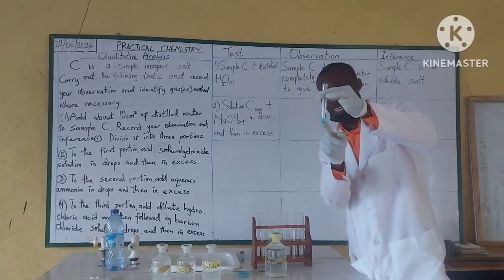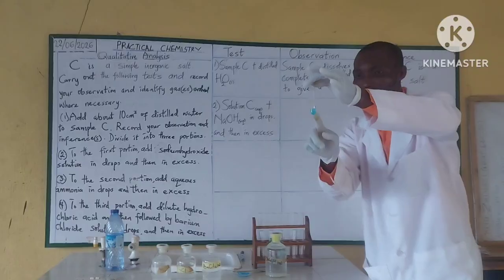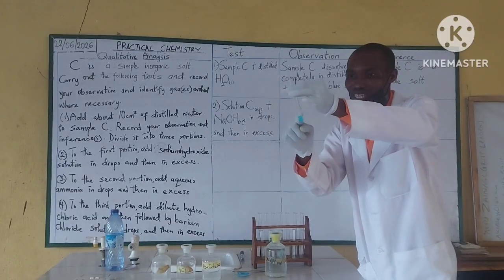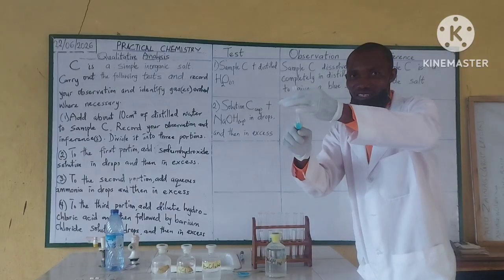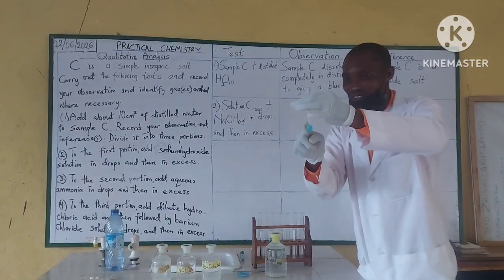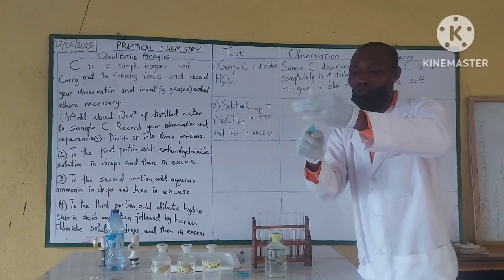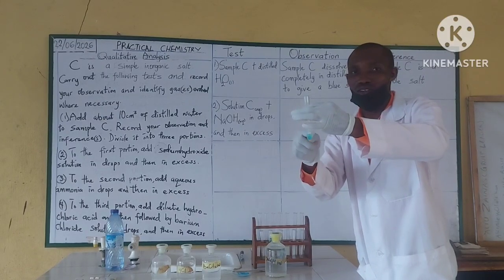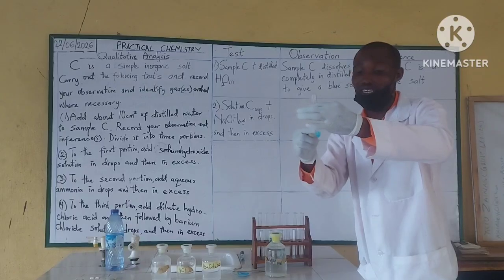By the time you check the body of the test tube, it's as if there is a kind of oil around the test tube, as if you are making use of grease. Those colorless grease we do use in cleaning our body.